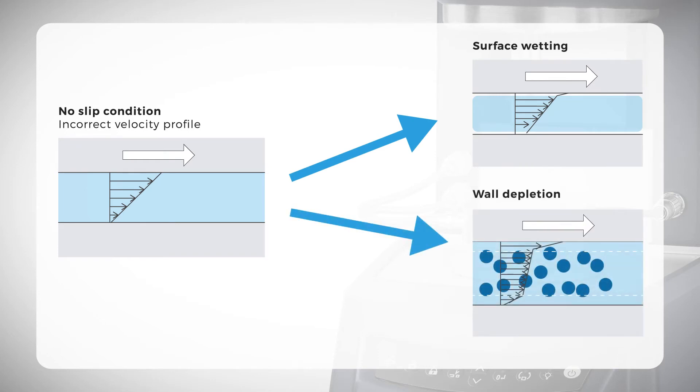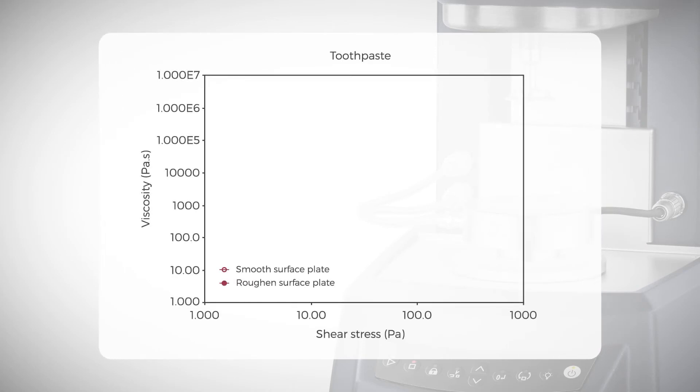Wall slip could either be caused due to surface wetting or wall depletion. When wall slip occurs, it shows the measured viscosity lower than the actual viscosity of the sample. Wall slip can also create an artifact lower yield stress.